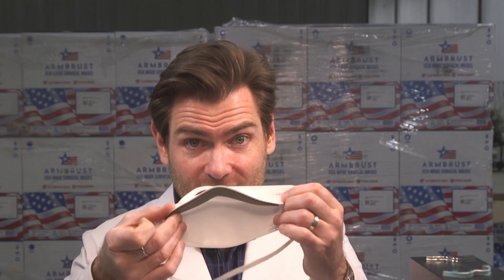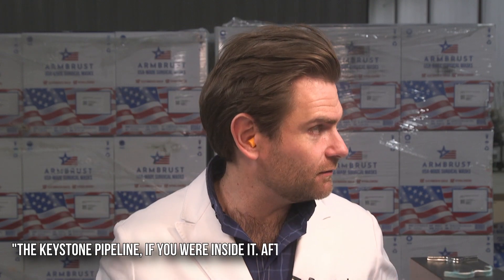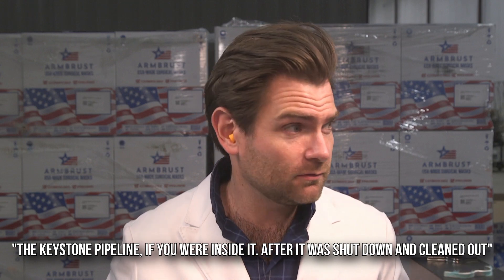The nose wire in this thing is insane. I'm going to put it on, because that's what we do here — we put on masks. I remember the K100 that I tested. You cannot hear me in this mask, huh? This thing is like a permanent mask. This could withstand bullets — it's like a bulletproof mask. This nose wire is probably the strongest nose wire I've ever come across. Smells horrible. Absolutely horrible. It smells like the Keystone Pipeline if you were inside it after it was shut down and cleaned out, but it still smells like petroleum.